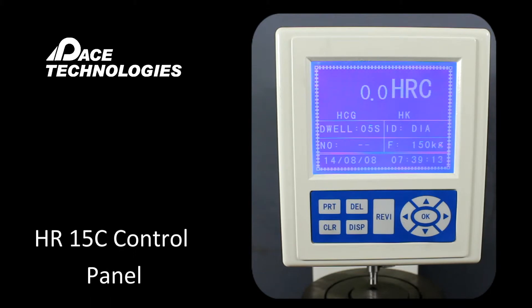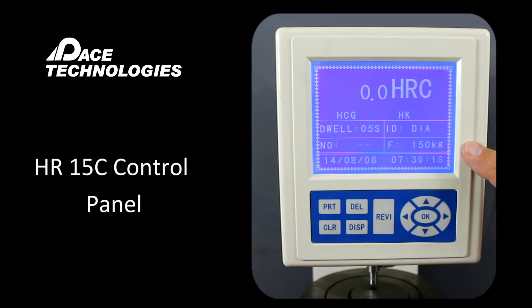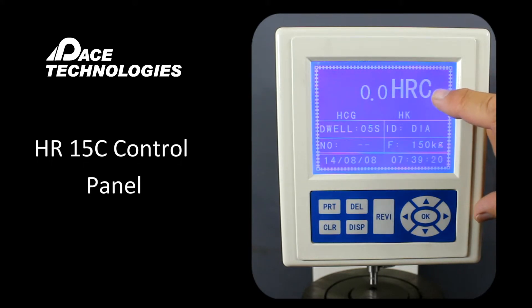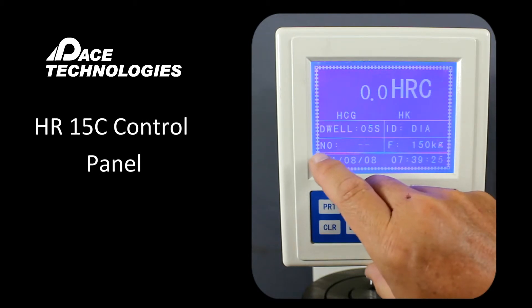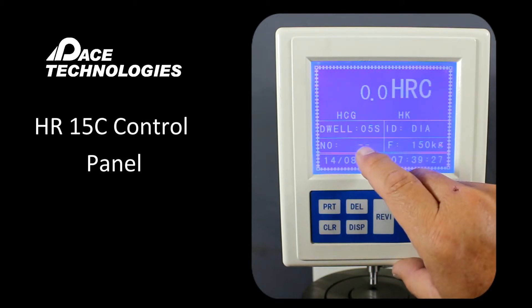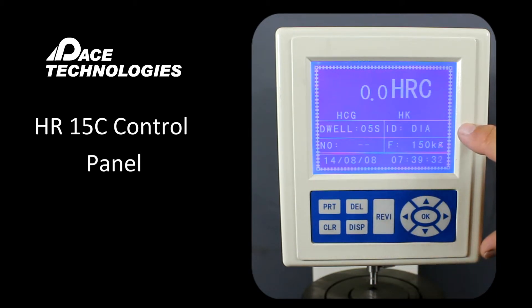The HR15C control panel. The LCD screen here is showing the parameters that we have set for the system. Right now we're set up to do an HRC or Rockwell C hardness test. The dwell time is shown here, the number of tests we've done would be shown here, and a date stamp is shown at the bottom. The ID will display which indenter is required — in this case, a diamond indenter. The force required for this scale is 150 kilograms. So to do an HRC measurement, we need a diamond indenter at 150 kilograms.